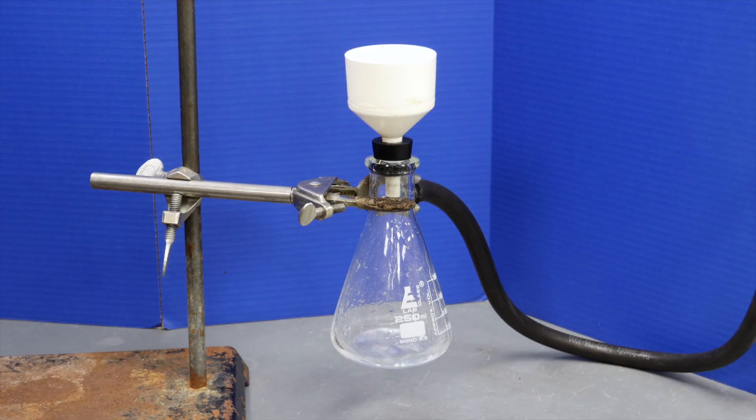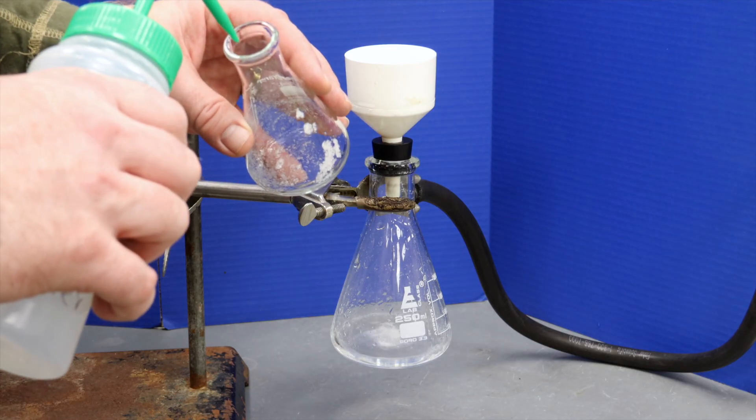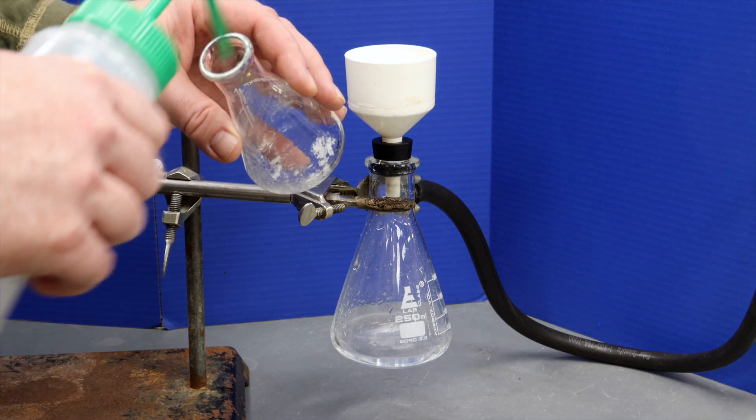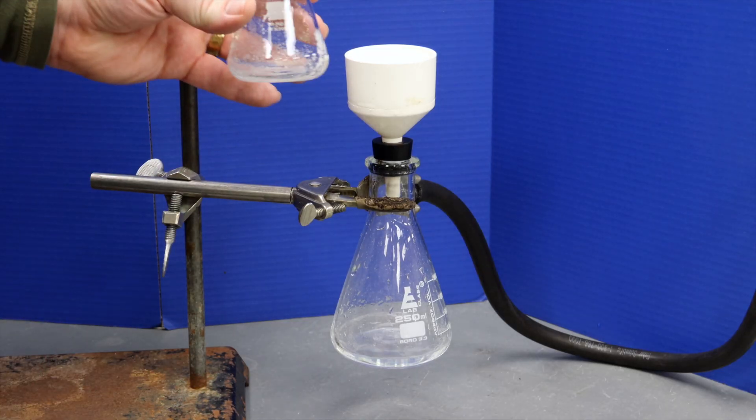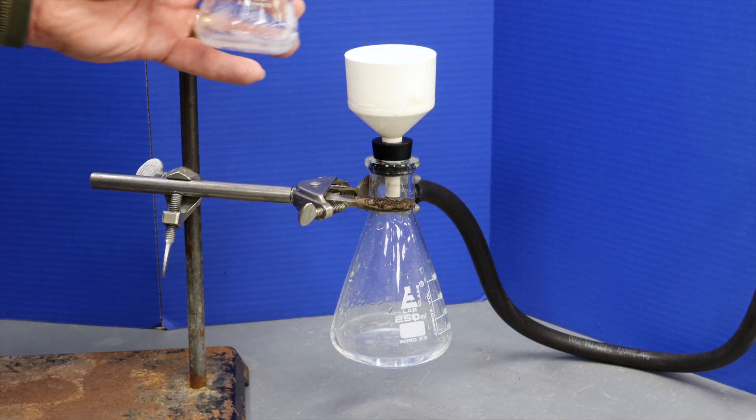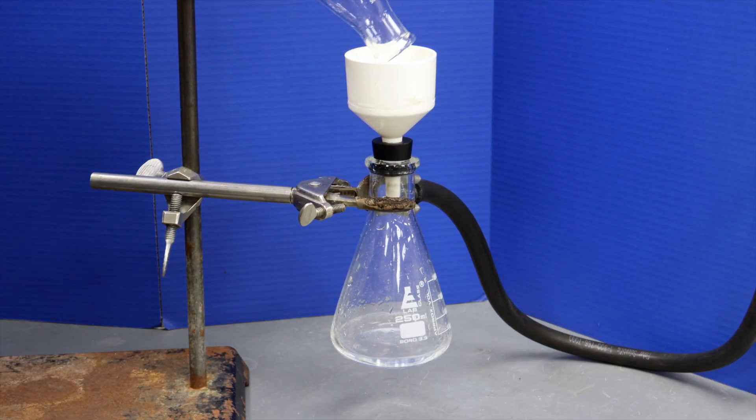It is not uncommon for some of your solid to remain in the flask that you poured from. How you deal with this depends on how soluble your compound is in the solvent. If it's not soluble, you can simply add a bit of that solvent into the flask and pour it through the Buechner funnel.